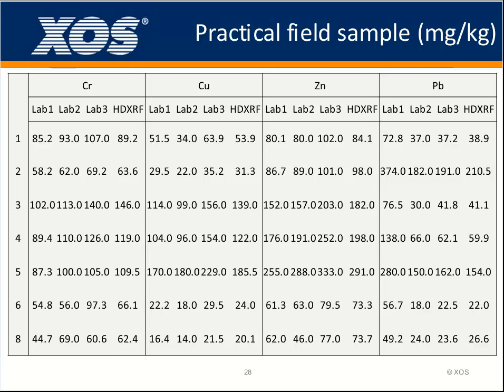If we send even the same sample to different laboratories, we can get different results. But for HDXRF, it is quite easy. No matter who is operating, no matter which machine of HDXRF, if we are analyzing the same sample, we will get the same result.